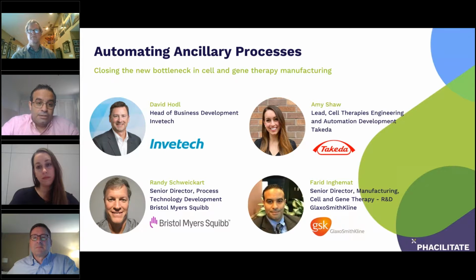Automating the data and digitalizing it is extremely important to that turnaround time as well. The more that data is digitalized, the easier it is for quality assurance to review, to release, and for exceptions to be noted.